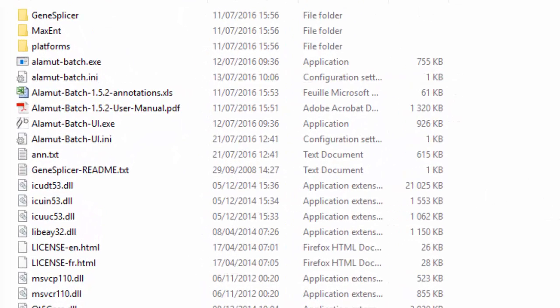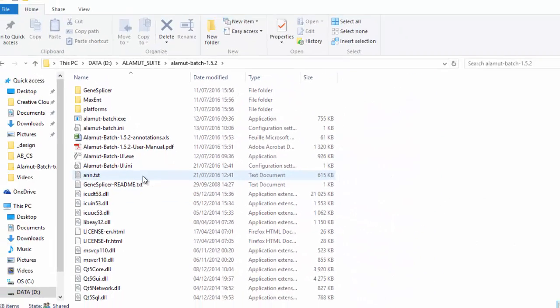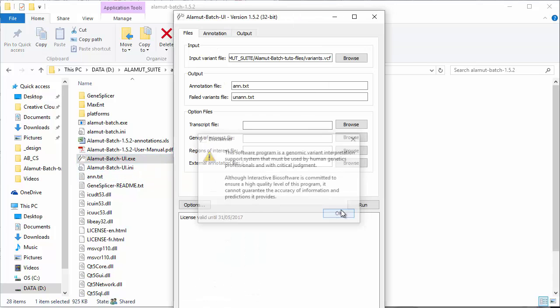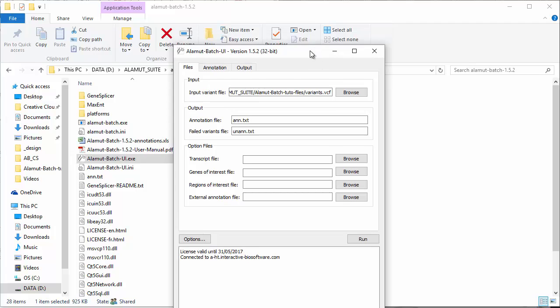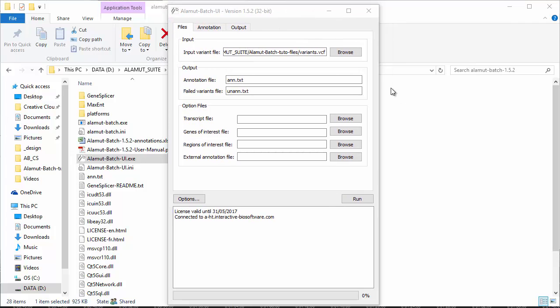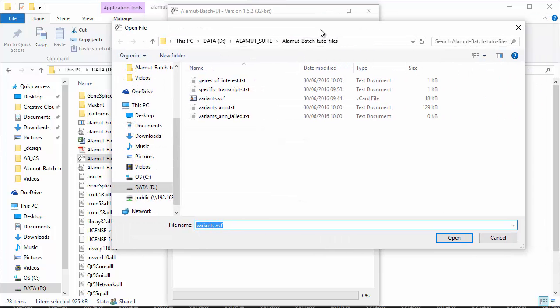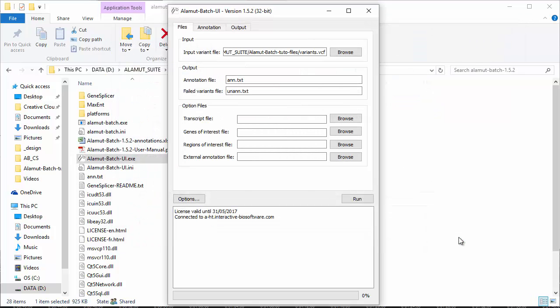When you launch the Alamut Batch interface, you first need to browse and select the input file you want to annotate. Alamut Batch takes as input a list of genomic variations and outputs a list of annotations for each variant when it's located inside a human gene locus. VCF files and tab-delimited files are supported for variant input. You can find more information on the format of these input files in the user manual.